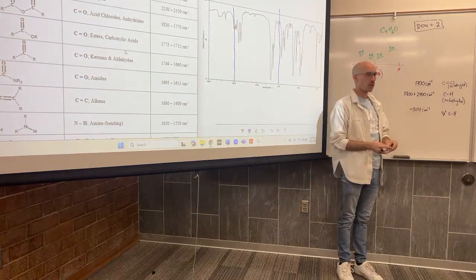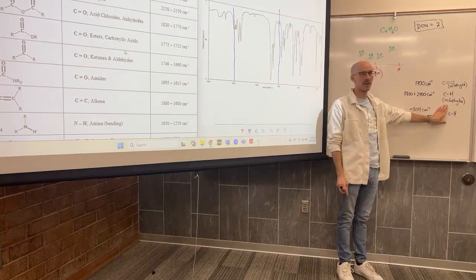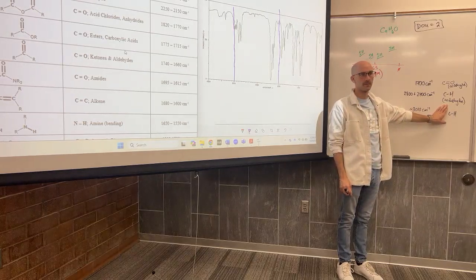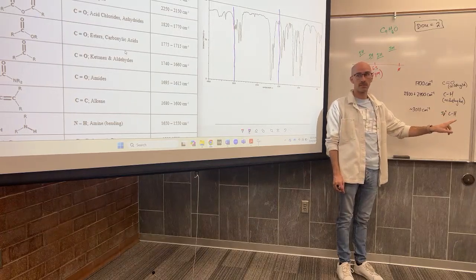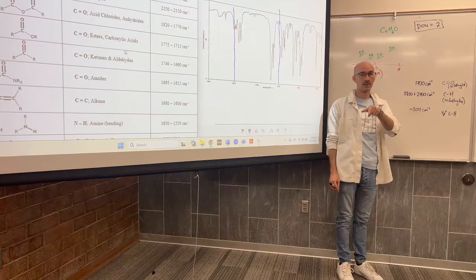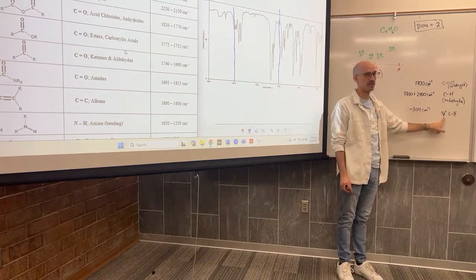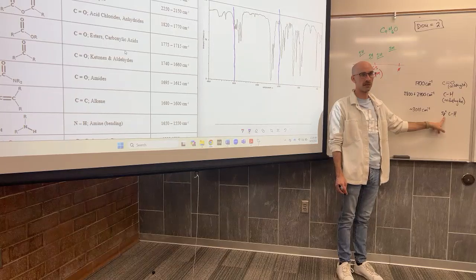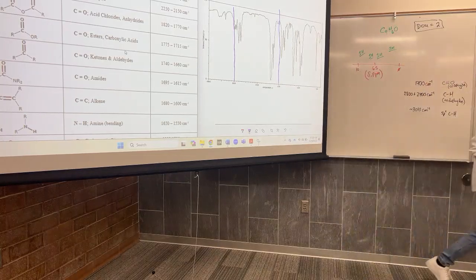Now, could Abram have told me, I see a signal above 3000, that's a CH bond? Because it's really meaningful that it's an sp2 CH bond. It actually tells me there's another bond type I should be looking for, something that corresponds to an sp2 hybridized carbon. Hayden? I was gonna say, past that 3000, there's that broad stroke with that mini peak.